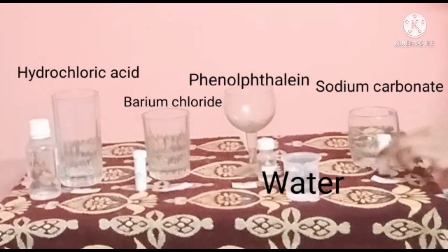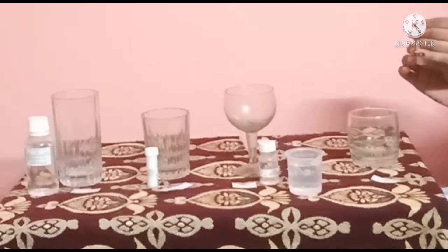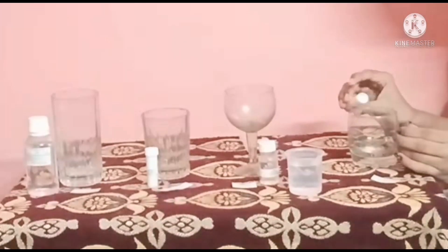So, we have decided which experiment to perform. We have four chemicals in front of us now. I chose sodium carbonate and phenolphthalein. And I chose hydrochloric acid and barium chloride. Here I am pouring into the first glass a few pieces of sodium carbonate.